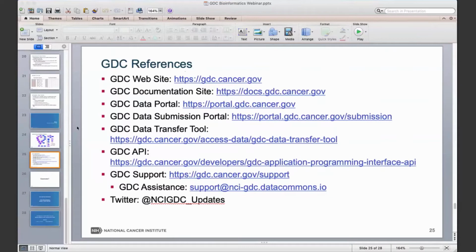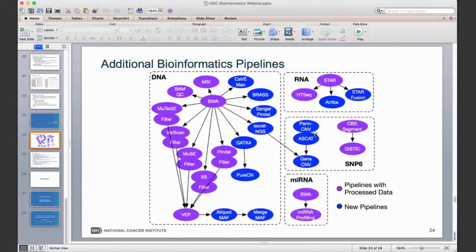This particular tool tries to categorize the somatic status by computing metrics such as the tumor purity, heterozygosity, and copy number changes, and tries to predict whether a variant you see is somatic or germline. It will label the variants with a probability that allows for better filtering. So those are the main changes.